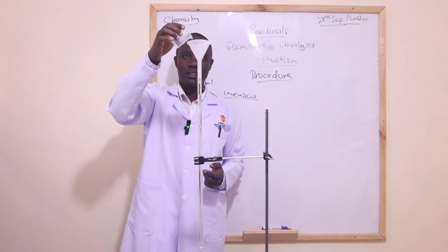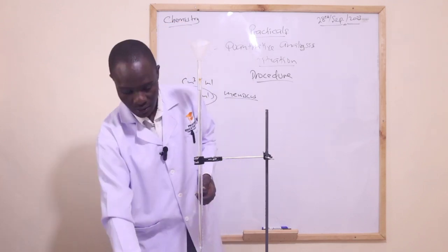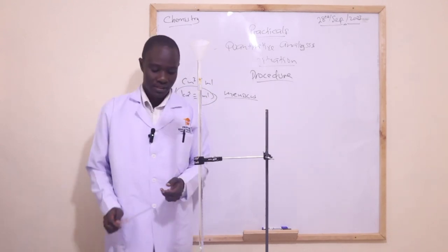So you fill it just slightly above the calibration, just like that.